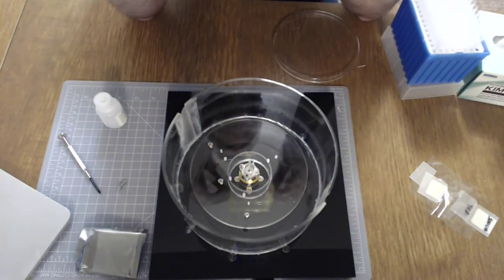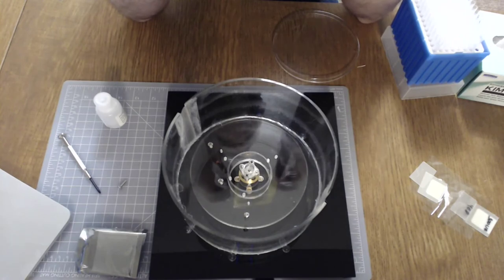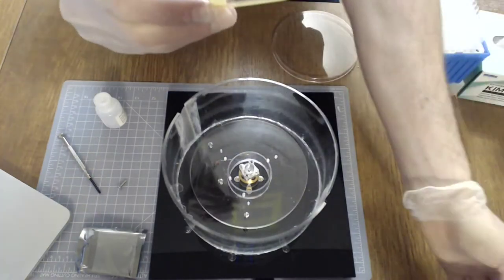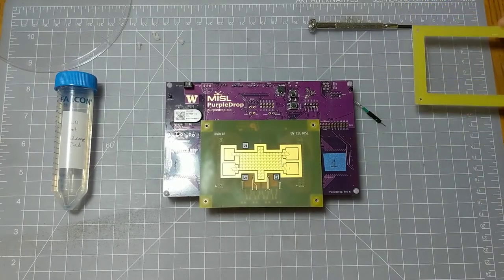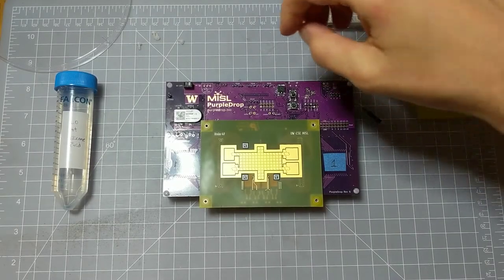After spin coating it goes into the oven to bake for about 30 minutes at 120C.